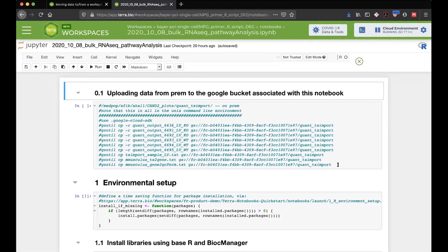So hopefully everyone has gotten, or is in progress of copying over, this workspace and has gotten this workspace going. And again, if you fall a little bit behind or you wind up getting to this after the fact, don't worry about it. You can shoot me an email if you wind up with any issues, but it should be pretty self-explanatory.